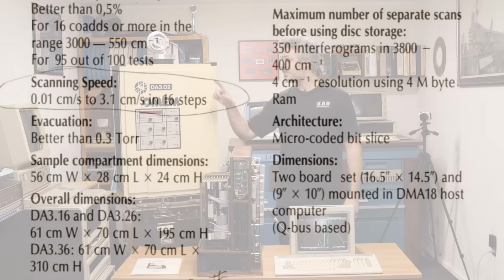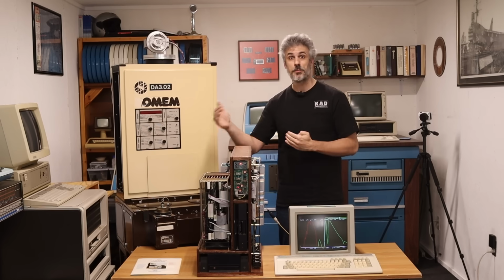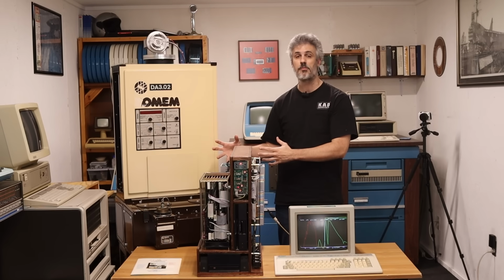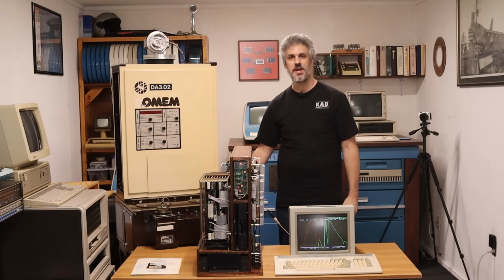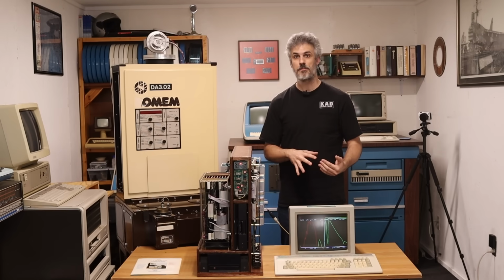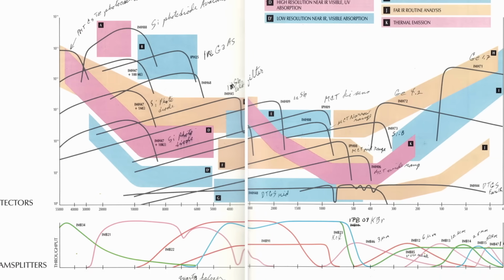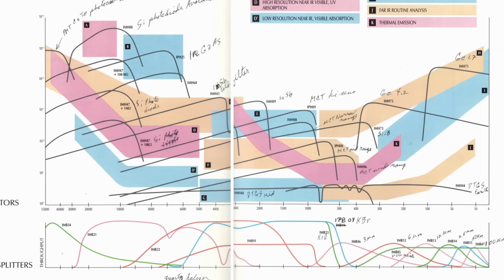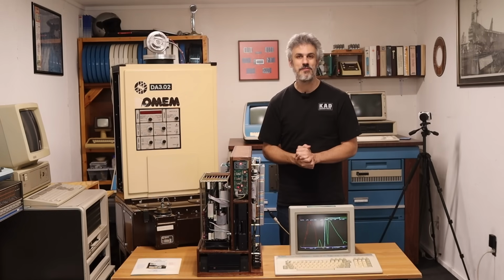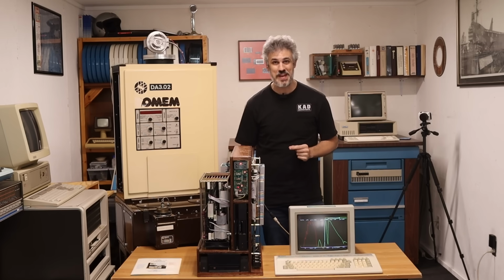Yeah, that's right. This entire thing can be pulled down to a vacuum of a couple of millitorr, and that's ultimately where we're going. I want to get a vacuum pump on this, the proper vacuum pump for it, and pull the whole chamber down to vacuum and continue doing measurements in the visible range at vacuum. And once we are sure that all of that is working perfectly, then we'll start to push into the near infrared range and the far infrared range. Ultimately using this DA3 and PDP-1173 combo to do real deal science just like it was 1985.